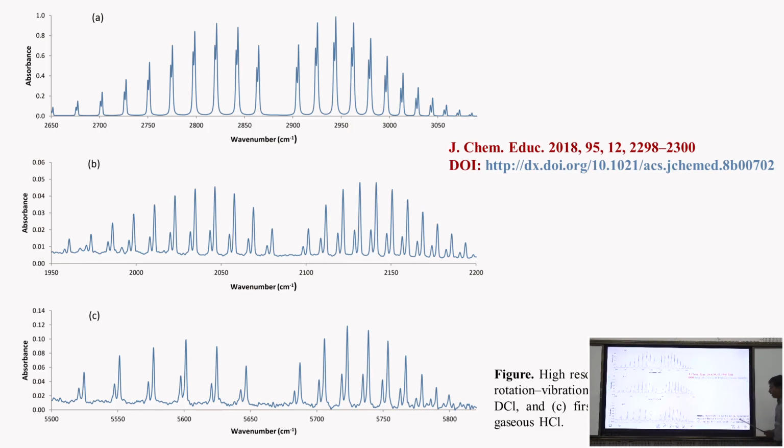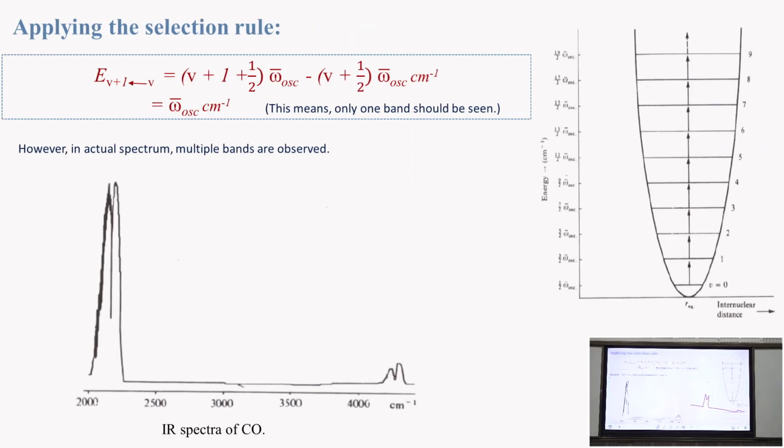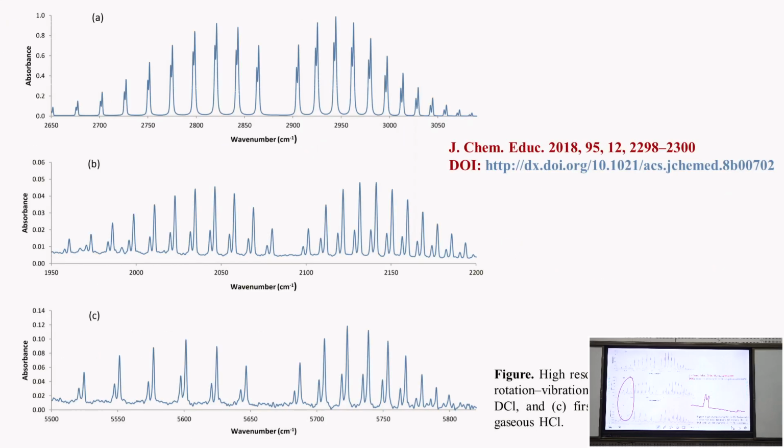This one you have seen last time, in the last slide, I showed you one band like this and like this. This band was looking quite low resolution. If you do the experiment with high resolution spectroscopy, then you see this kind of thing. Where is it published?